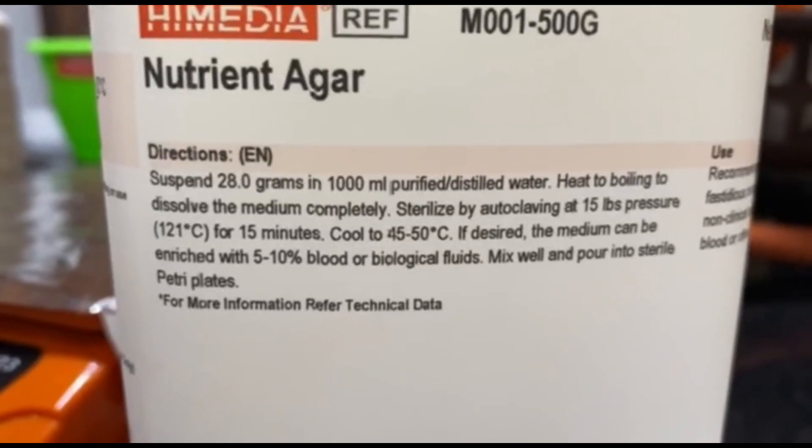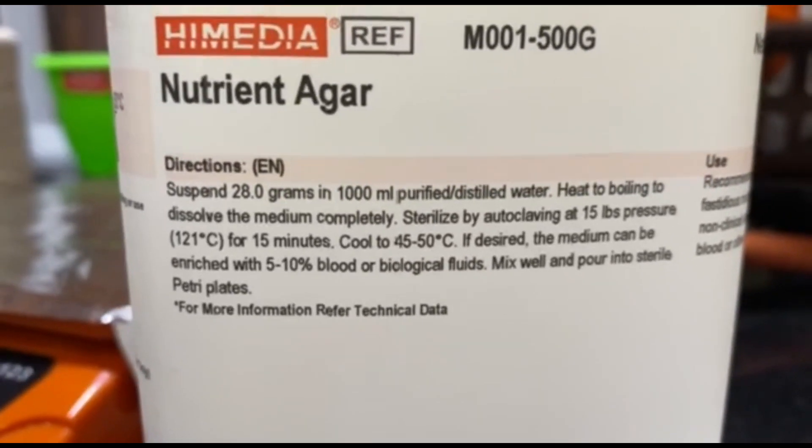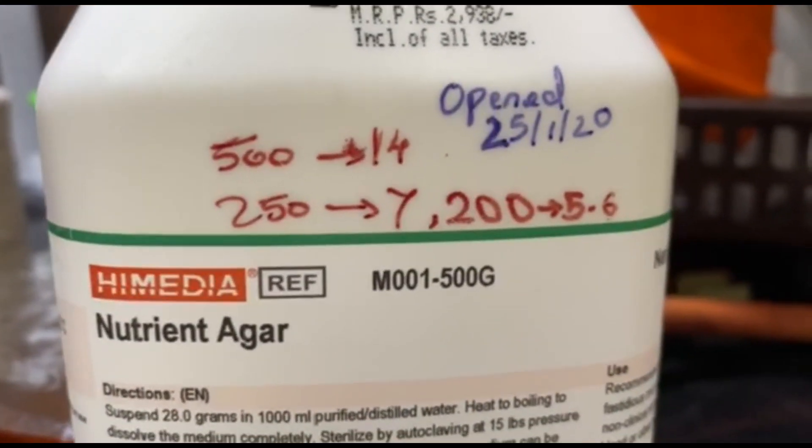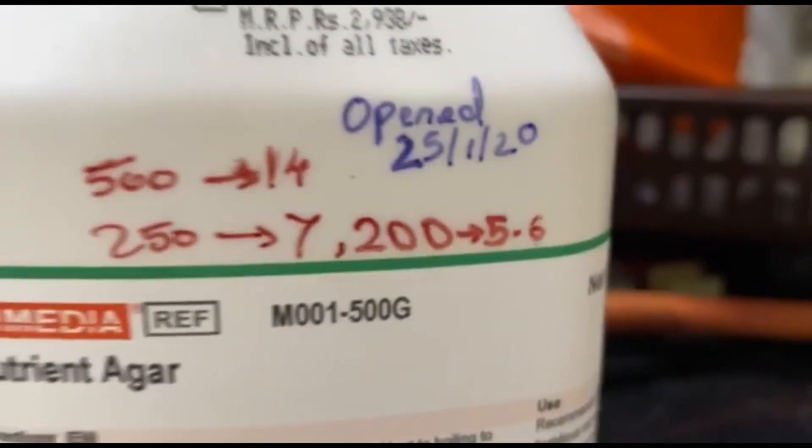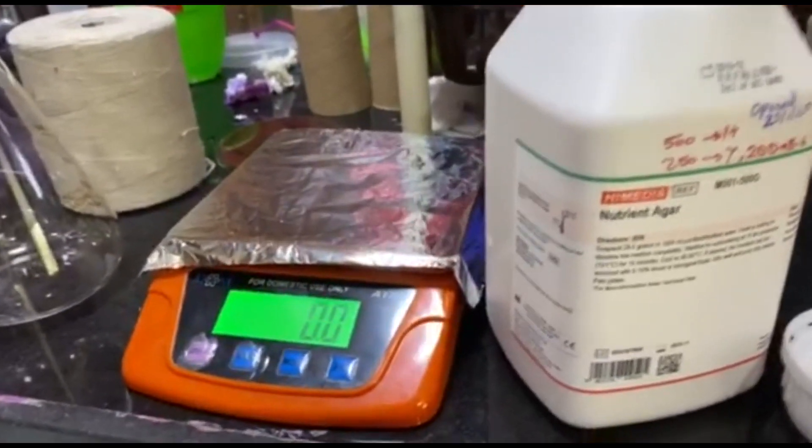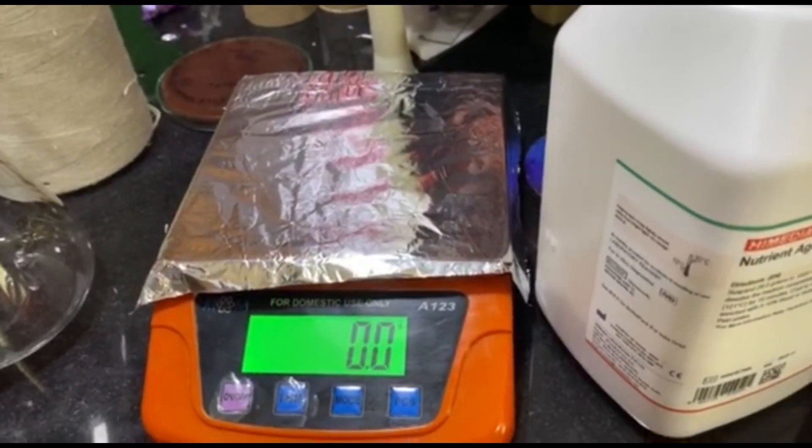We are using human blood, 5%. Let me tell you first how to do the calculations. If you can see here, for 1000 ml distilled water, 28 grams is needed. Today we will make only 200 ml of agar, so these are the calculations. After you are done with your calculations, this is a measuring machine, so aluminum foil has been already kept on it.